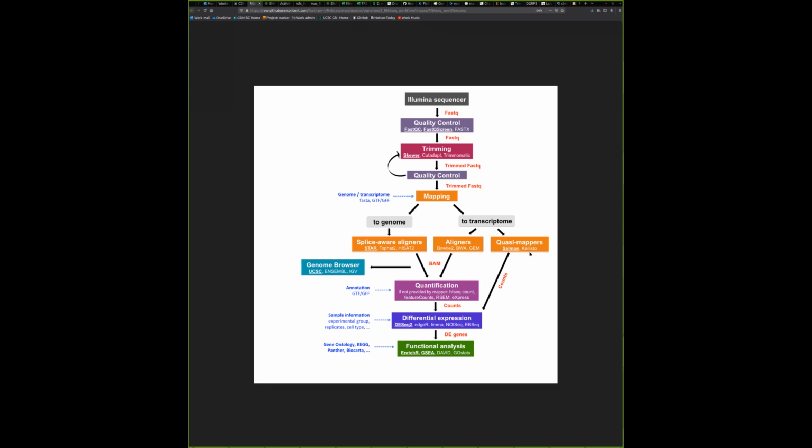The easiest option is to use Conda or this Miniconda package manager. So give that a try first, especially if you're on a Mac, that should install quite well. If you're on Windows, I would suggest using the other method and try to install all these 3 packages if you want to follow along with the tutorial. Those who are having problems with Conda, you can also use the other method. That should not be an issue.